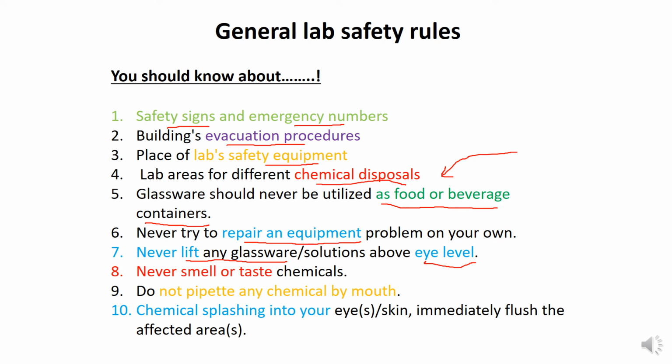I used to say this is not only specifically for the lab. You should also remember these few points in your practical life, for example in your domestic life. For example, if somebody is working in a store or in a kitchen, and you have a liquid that contains some spices and you are holding it above your eye level, if a spillage happens, it may go into your eyes. So this is a very important rule.